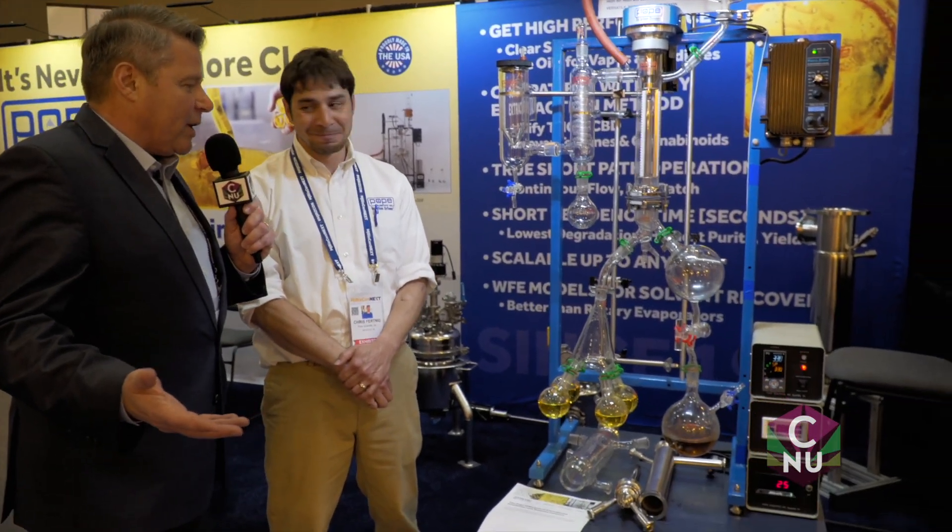Hey, as we make our way through the exhibit floor here at MJ BizCon, we're taking a look at some of the interesting exhibits, and I ran across Chris here with some kind of science experiment gone crazy. What is this, Chris?